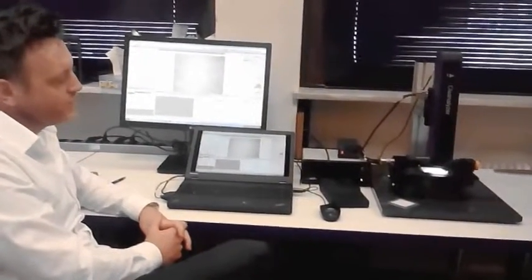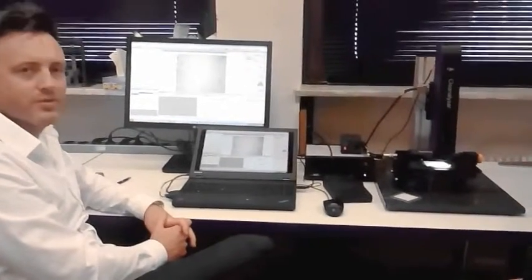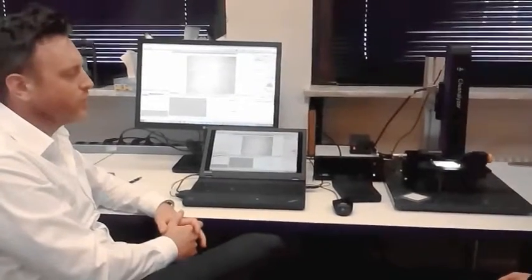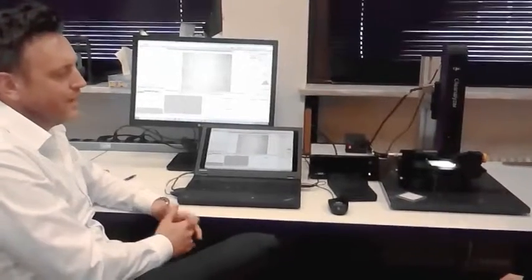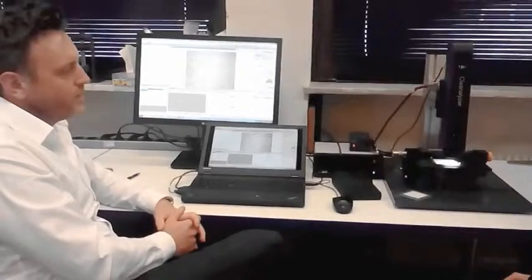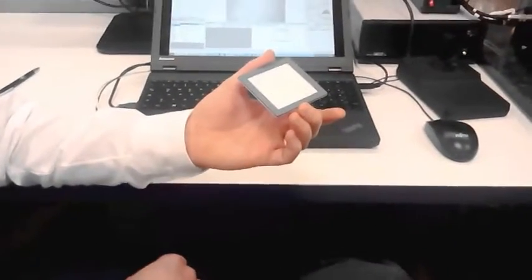So this is an instrument which is designed for analysing residual dirt on metallic parts, all kinds of automotive parts, small components that are integrated into engines and other mechanical devices. The purpose of the cleanalizer system is to analyse residual particles which are deposited onto filter papers after calibrated washing procedures.